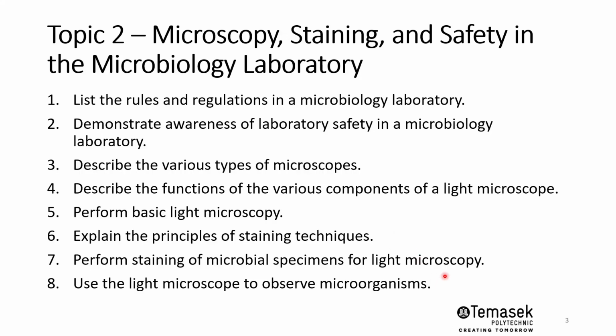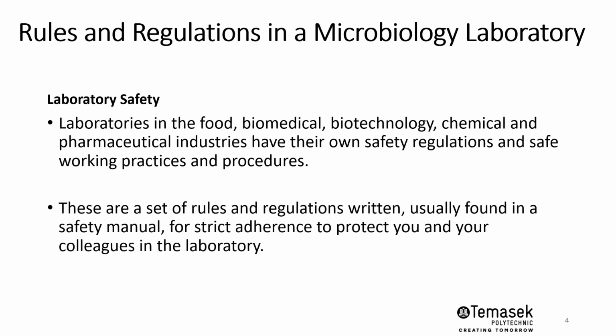So let's dive into the first point here. For rules and regulations in a microbiology lab, laboratory safety is of importance. The laboratories in the food and biomedical sector, as well as in the chemical and pharmaceutical industries, each have their own safety regulations and safe working practices, as well as their procedures.